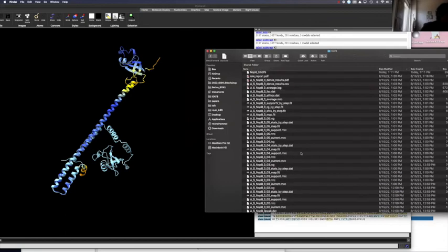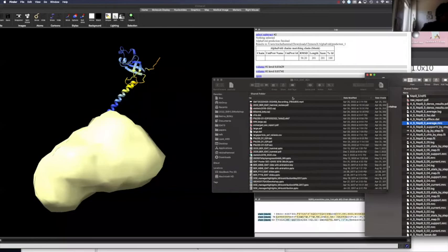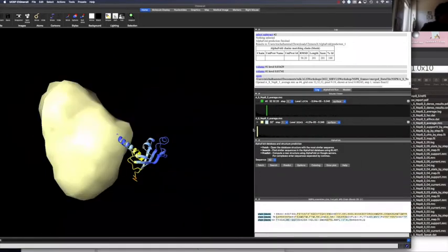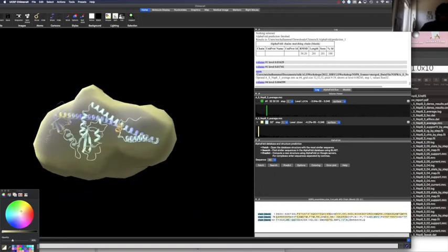You will receive an MRC file for each of the 5 runs, but obviously you want to look at the final calculation, and drop it in. Obviously we want to put it a little bit in.